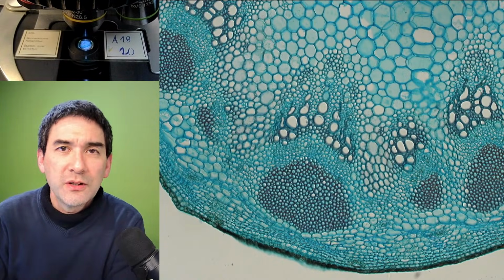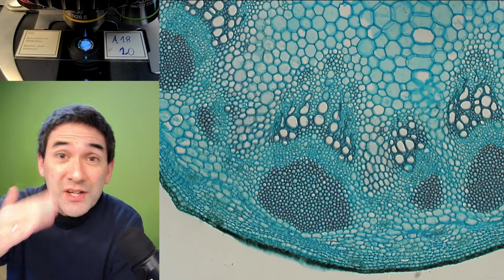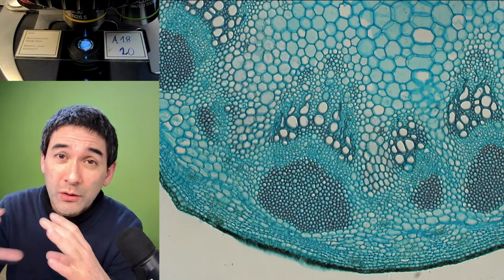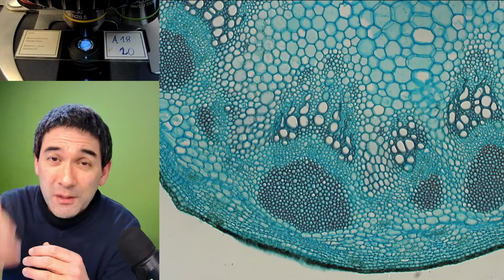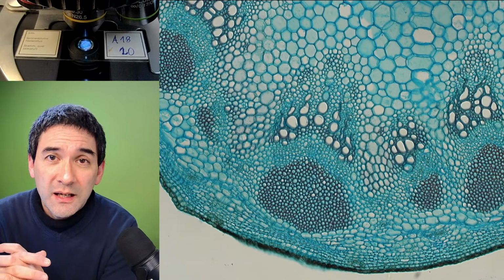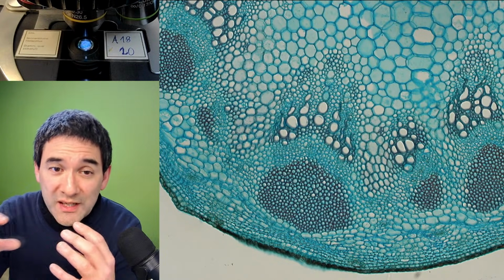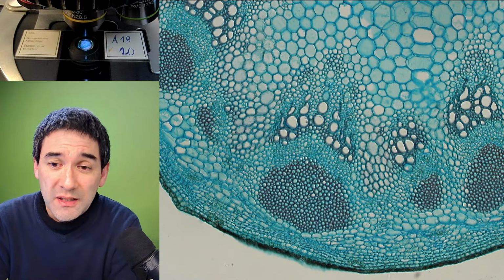You have those vascular tissues, the cells that carry the water up and down. You have them on the outside, right? By the way, this is also one of the reasons why you've got to be careful not to damage the bark of a tree, because the bark is where the living material is. This is where all of the vascular tissue is for transporting substances up and down. For this reason, you've got to protect the outside. And a sunflower, being a dicot plant as well, also has those vascular tissues towards the outside. If the outside becomes damaged, the plant cannot transport substances easily anymore.